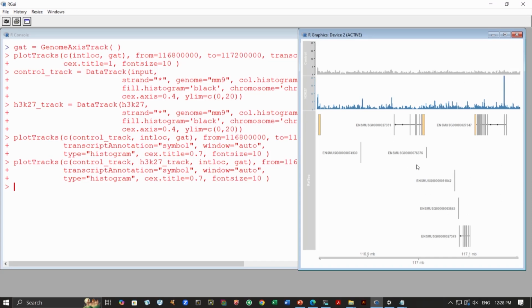Okay, so we can do a similar kind of analysis. We can try to identify which regions these peaks are in, whether they are overlapping with promoters, etc. The other thing we can do is also a peak call, right? As you remember, these are not actual peaks; these are actually the counts that have been obtained after binning, right?